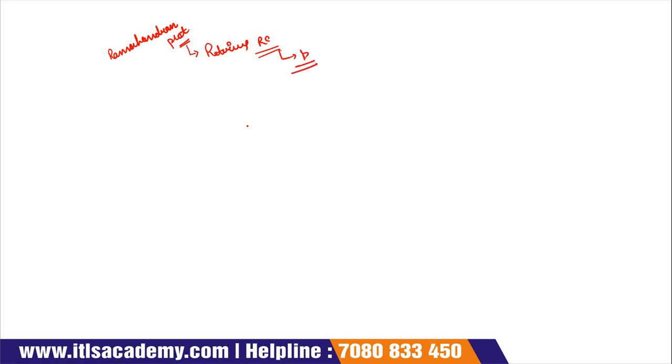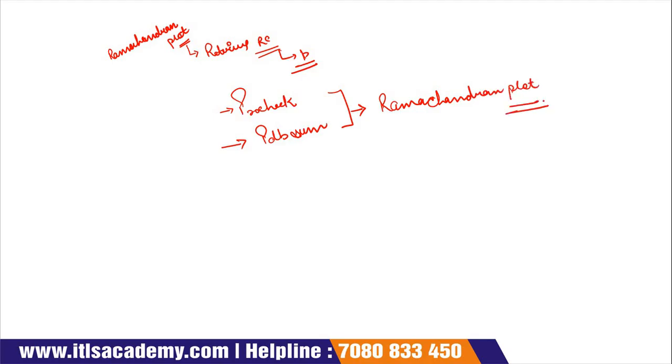To retrieve the Ramachandran plot, we use ProCheck and PdbSum. These are the bioinformatics tools that are used to retrieve the Ramachandran plot of a particular protein. In this lecture we will understand how we retrieve the Ramachandran plot from PdbSum.